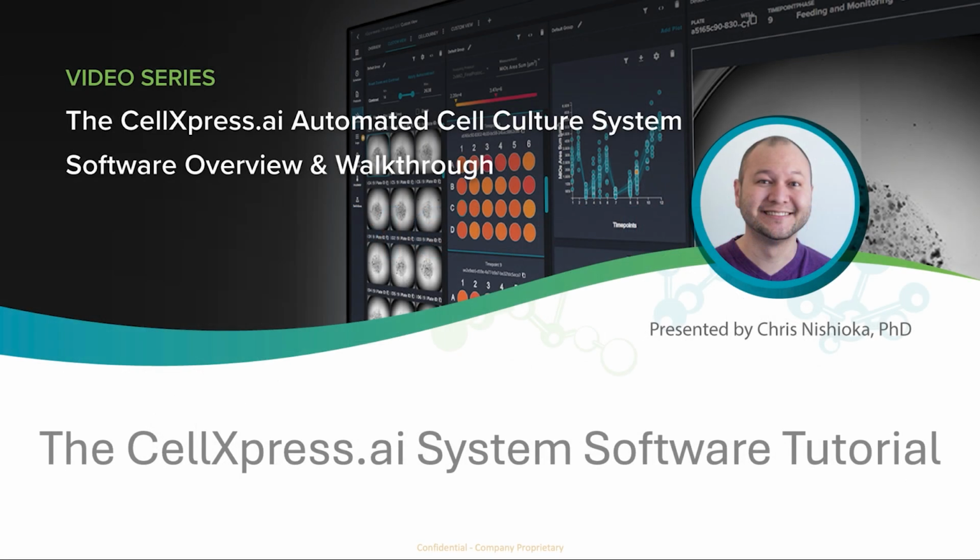In this tutorial video, we're quickly going to go over how to utilize the interface for the CellXpress.